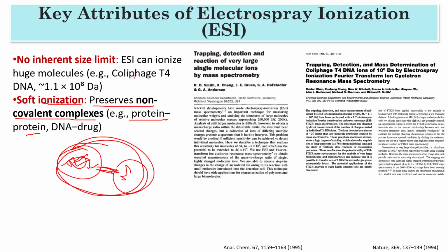Why is peptide always analyzed using ESI positive mode? How can we analyze DNA using MS? It has so many charges. Do all the charged moieties of DNA get ionized by ESI techniques?